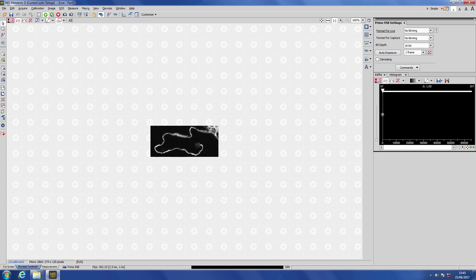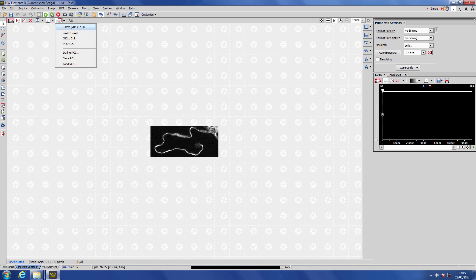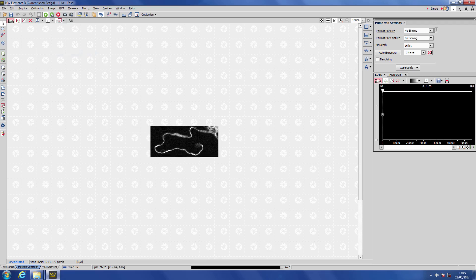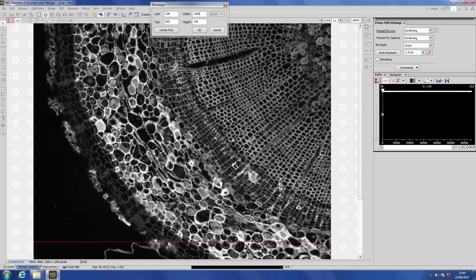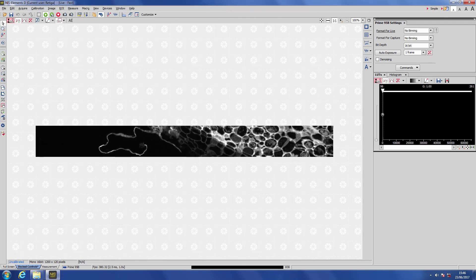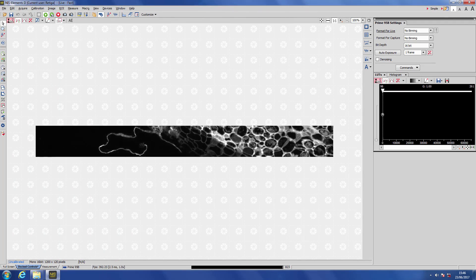Of course, as this is a sCMOS camera, the number of columns doesn't actually matter in our acquisition rate, so if we go to the full 1200 columns by 120 lines, we still run at 400 frames per second.